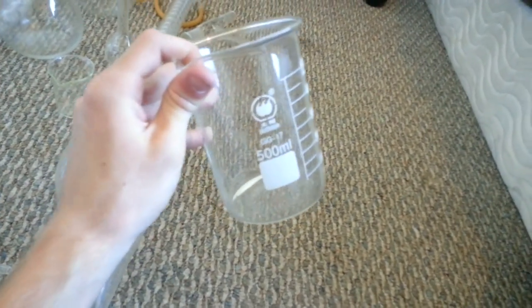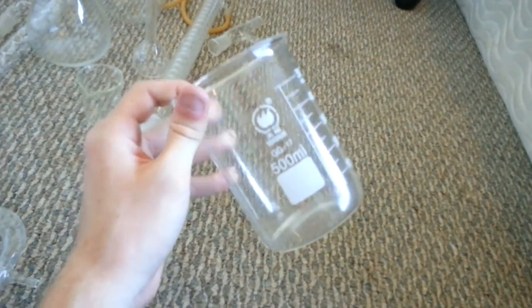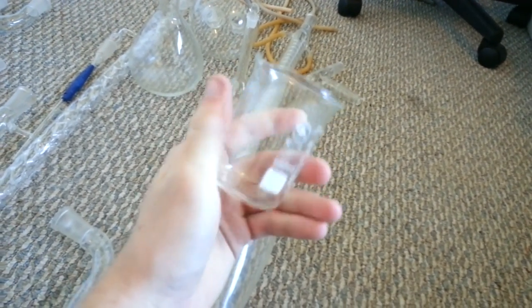Get some normal flasks like this just for storing stuff. This is 500 milliliters — I ordered a 1000 milliliter one that's coming, and a thousand is pretty good because I find this is a little bit too small. Here's also a 100 milliliter one, which is nice — kind of convenient, just for storing little bits of stuff if you need it.